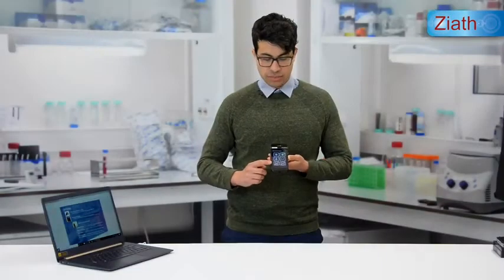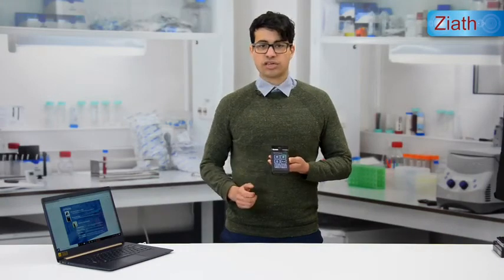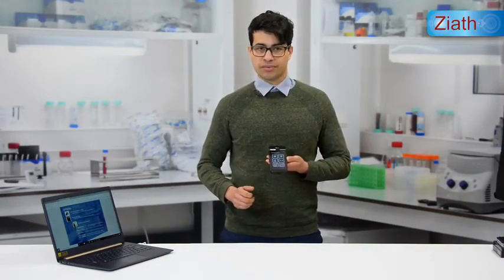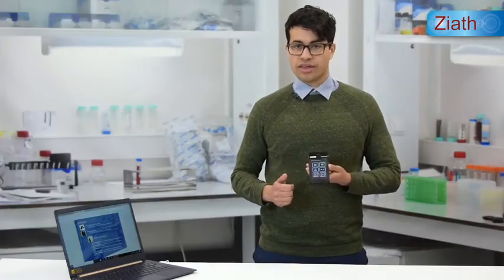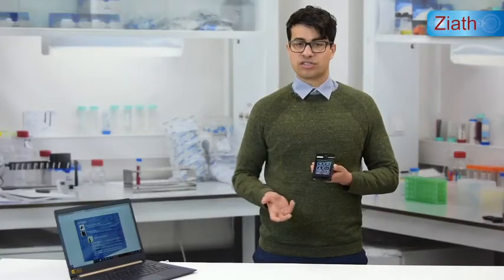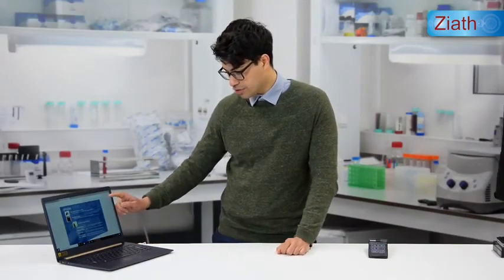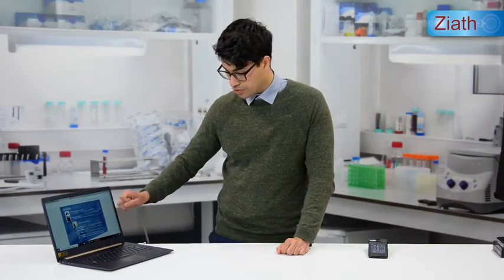The application in the bottom left is the Handheld Server. The Handheld Server is an optional extra which must be purchased separately. Once the Handheld Server is purchased, you can then buy additional extras for the device. These optional extras, which are all purchased separately, are shown on screen here.